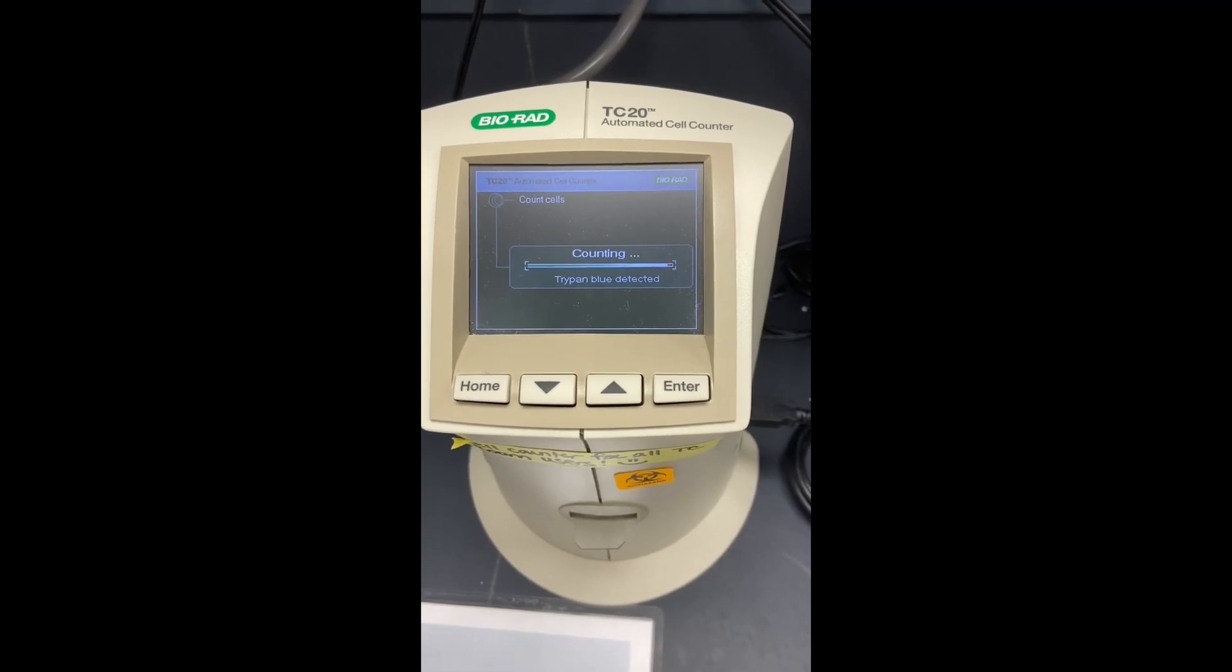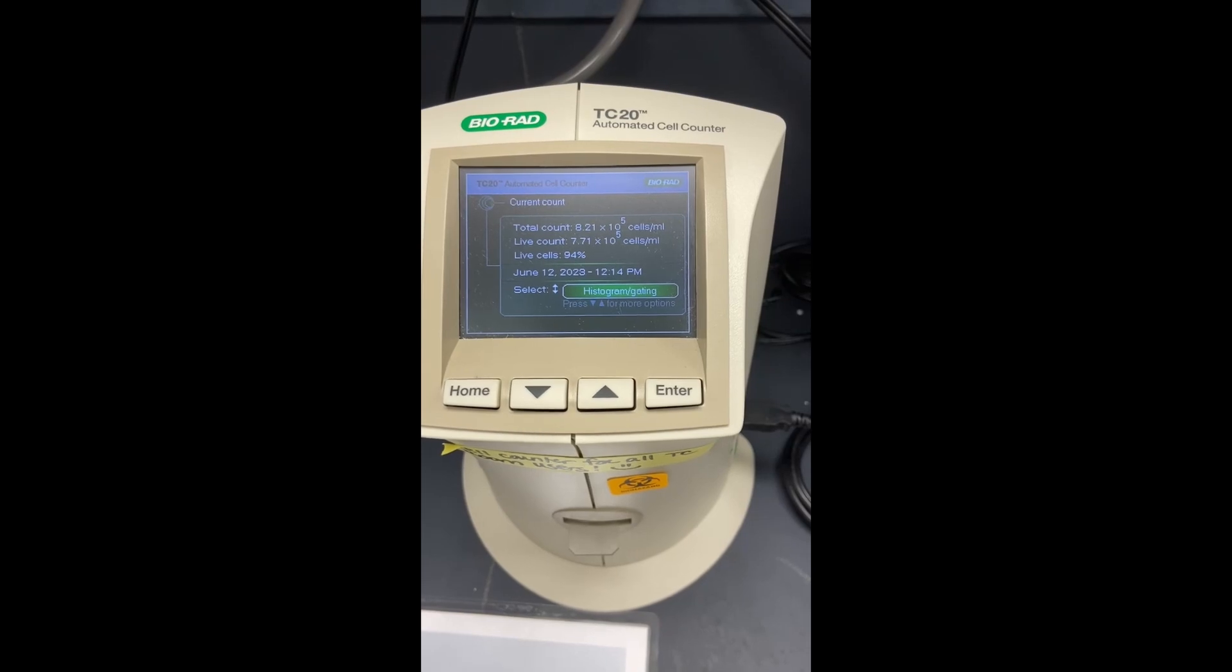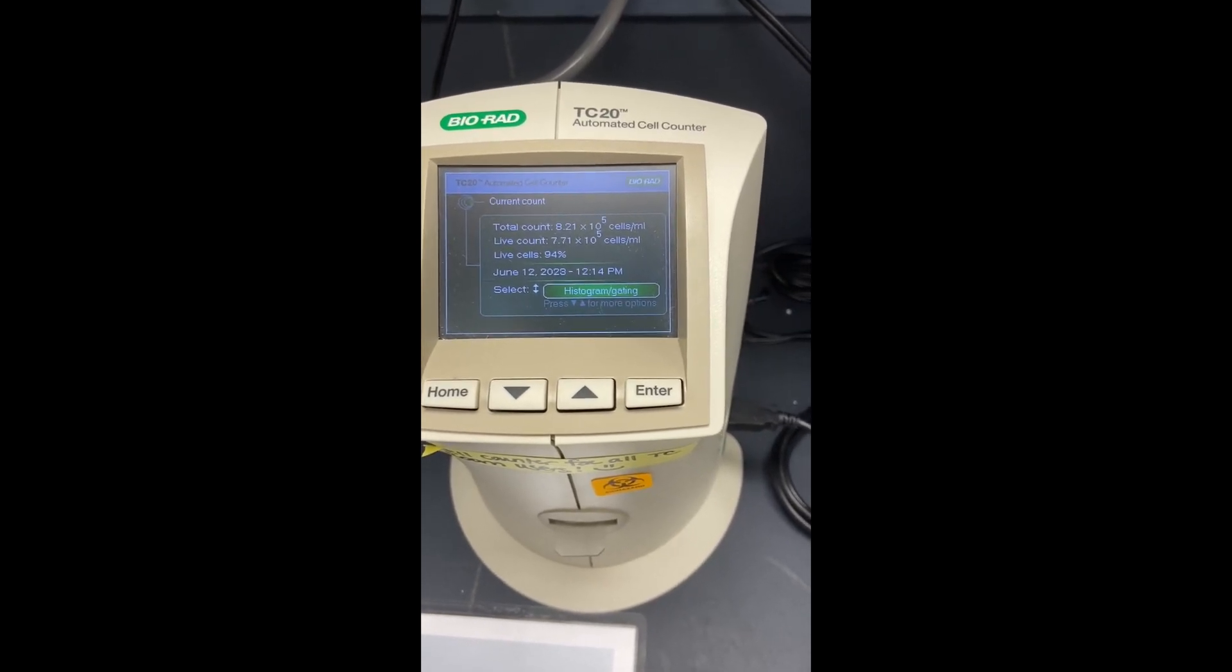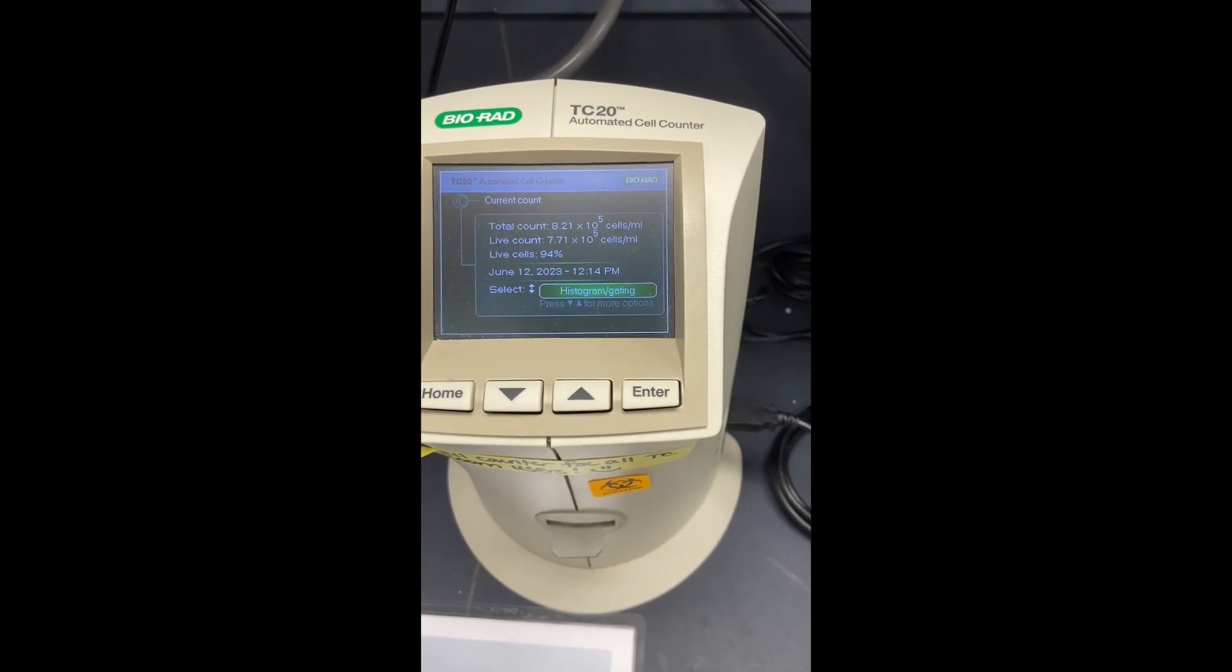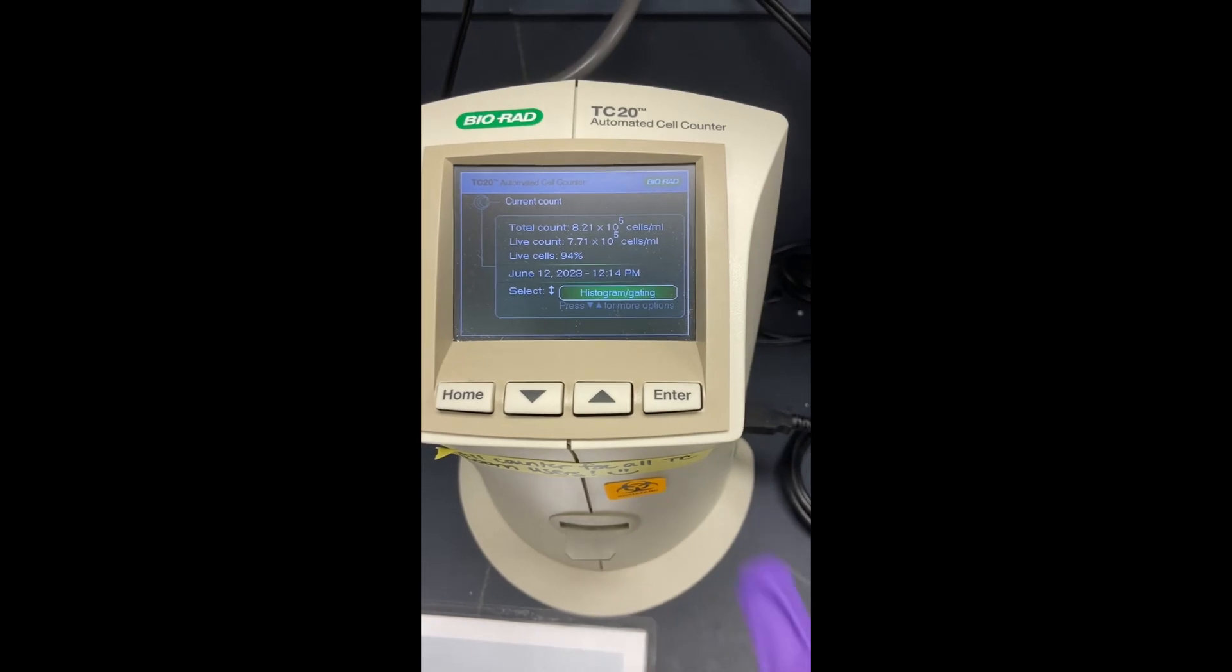So this takes a little bit of time. But when it's done, it'll come with your total count, your live count, your live cell percentage, your time and date, which is kind of nice.